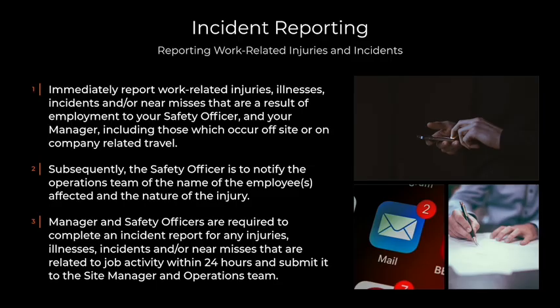Managers and safety officers are required to complete an incident report for any injuries, illnesses, incidents, and/or near misses that are related to job activity within 24 hours and submit it to the site manager and operations team. Accurately and thoroughly document the incident, including what happened, when, where, and who was involved, and any contributing factors. Follow up on the incident to ensure that all necessary actions have been taken to prevent similar incidents in the future.